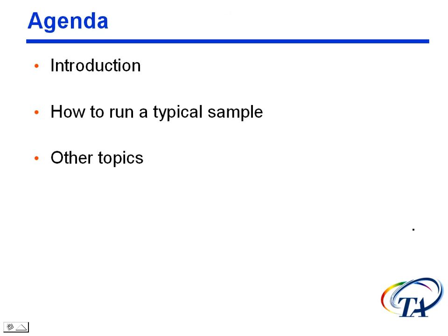This is what we're going to look at. We're going to have an introduction. We're going to talk about how to run a typical sample. And then we'll talk about other topics like calibration, some of the Q400 EM, etc.